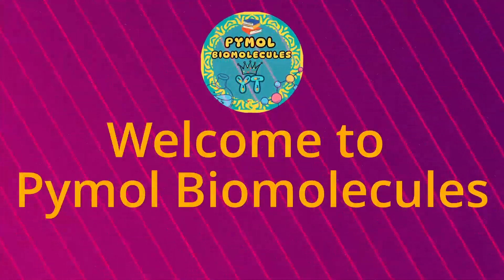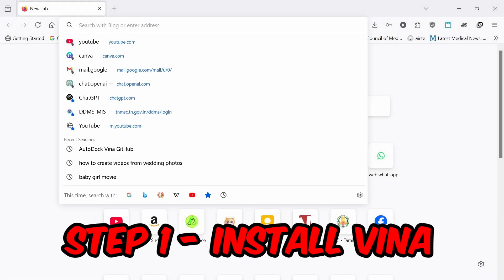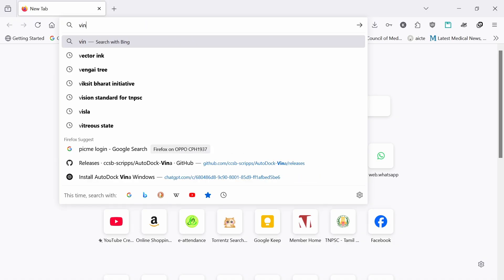Welcome to PyMol Biomolecules. In this video, we are going to see how to install Vina and do the virtual screening for multiple ligands.